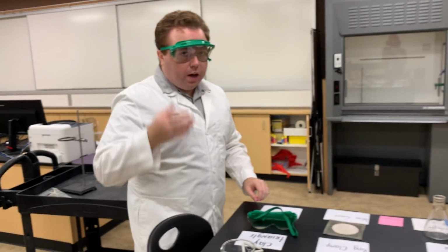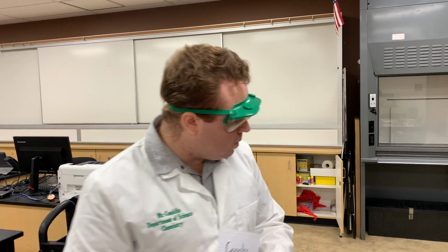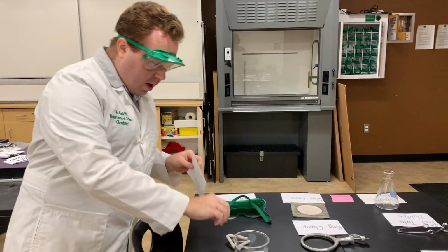Coming over here, the fashionable goggles, everybody's favorite. We use these to protect our eyes. It's one of our personal protective equipment. You must always have goggles on in the lab. Always, always, always. Up next is the clay triangle. We use this when we want to heat things.